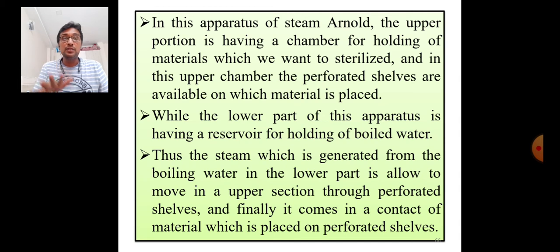The perforated shelves are available on which we are placing our material. Okay, while the lower portion or the lower part of this apparatus is having the reservoir for holding boiled water. Now this apparatus of the steam Arnold has two chambers, the upper chamber and the lower chamber.